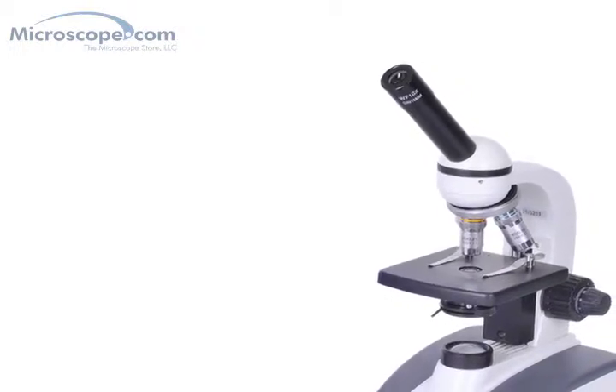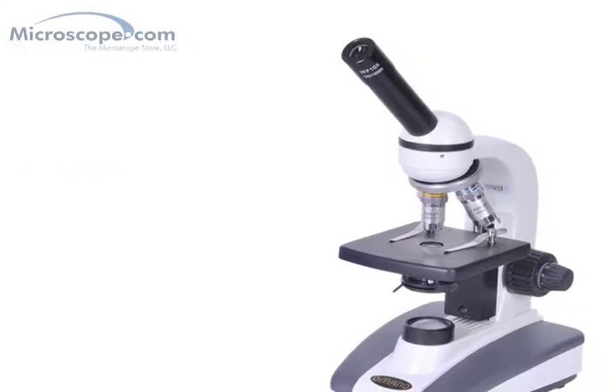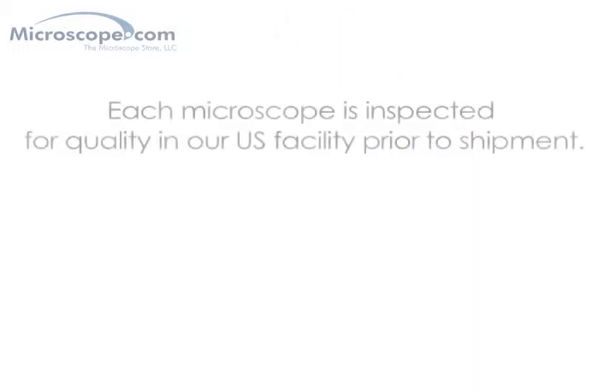In summary, the Omano 136C is an excellent entry-level microscope for student, hobbyist, or general-purpose use. It is durable, features high-quality glass optics, and is backed by our Omano limited lifetime warranty.